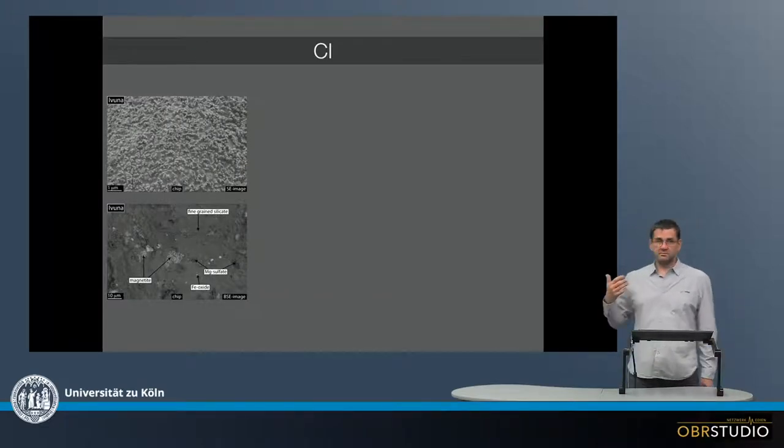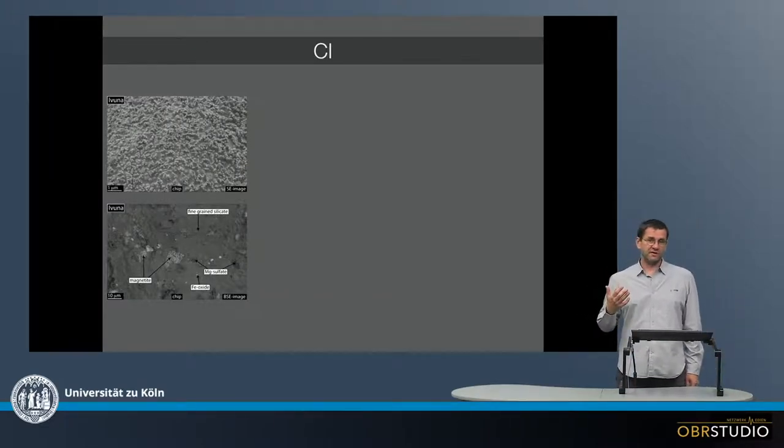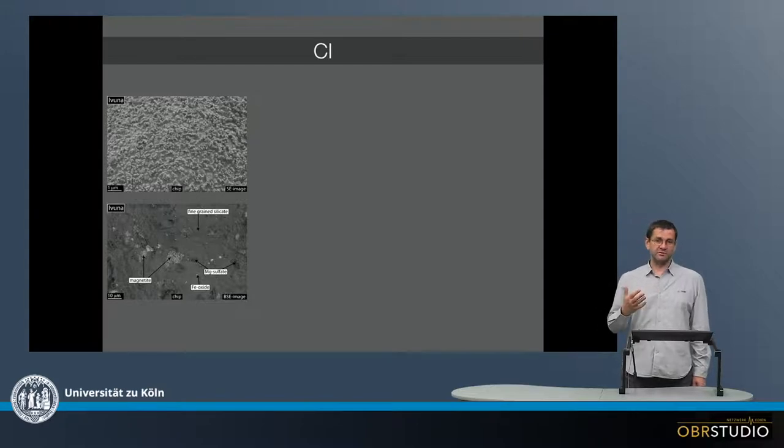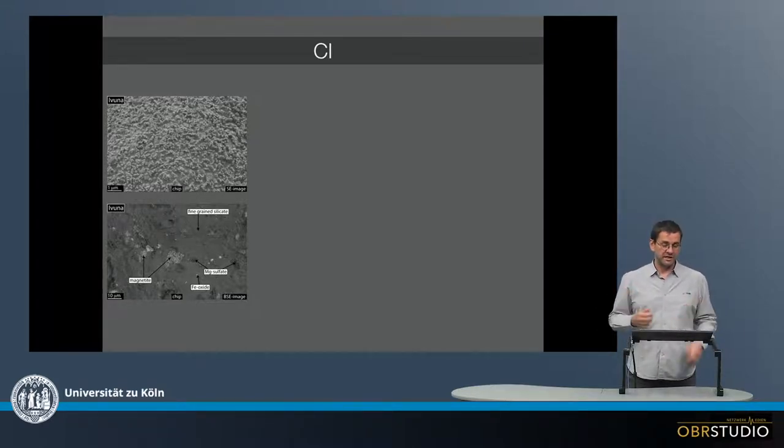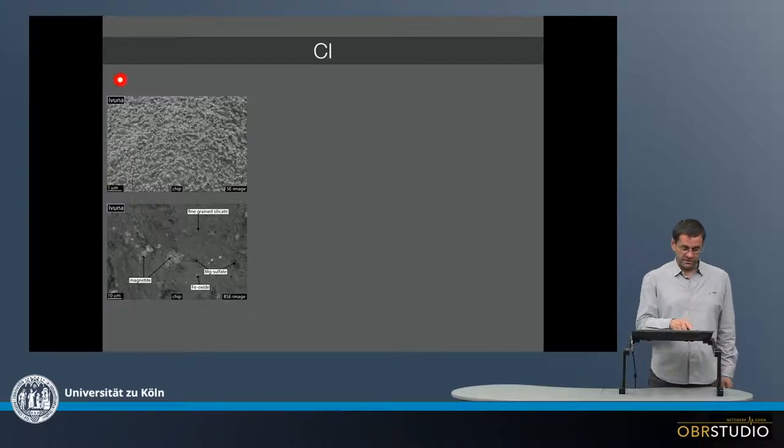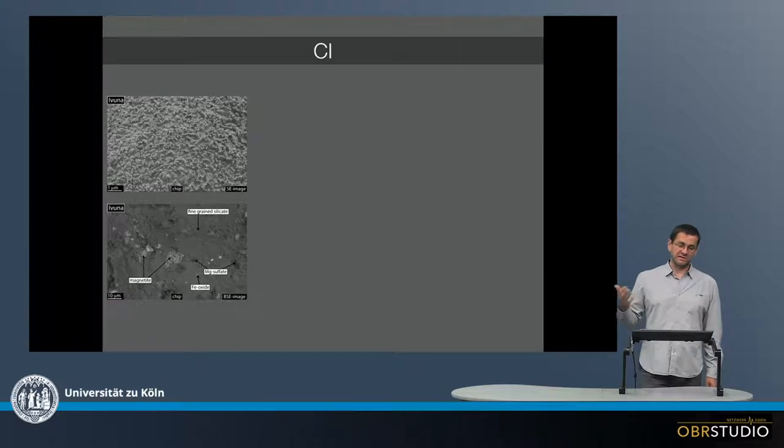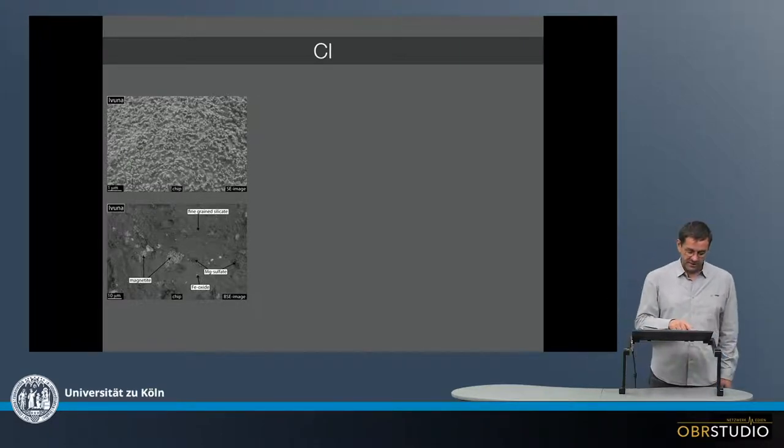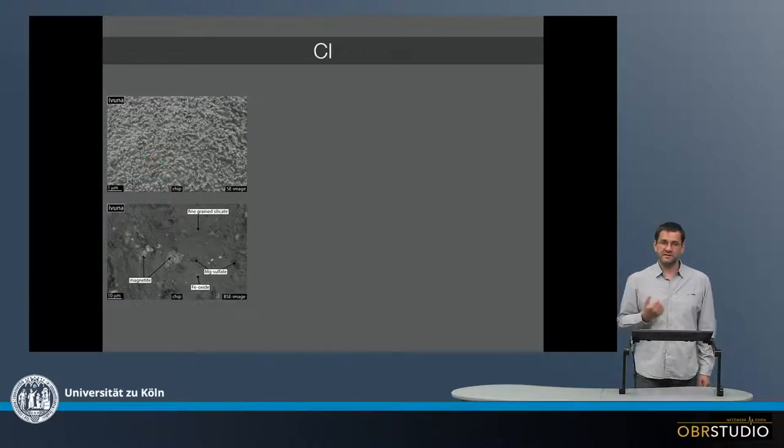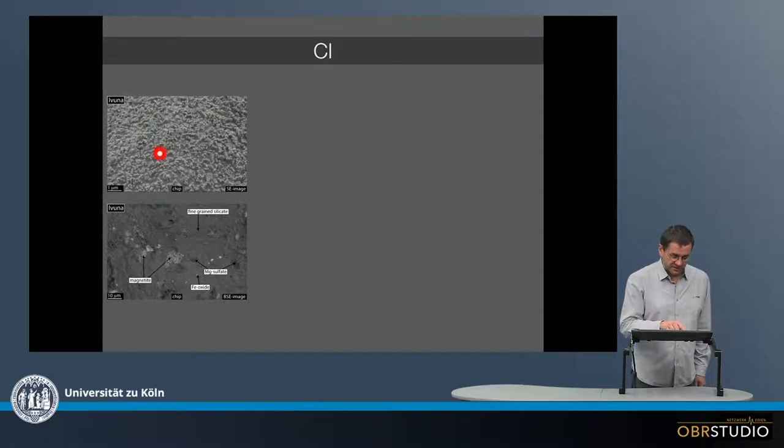Now the first chondrite to show here is a CI chondrite, and when we look at a CI chondrite, we basically only look at matrix, because these consist to 99% out of matrix. So the first one here is Ivuna, which is a type meteorite for the CI chondrite, CI, I stands for Ivuna. This is quite high resolution, so it's one micrometer. All the individual grains or crystallites here are in the submicrometer range, and in between is some sort of maybe amorphous material.